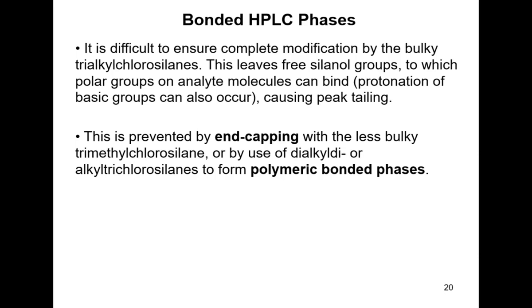And you may get some OH groups stuck in between them, and the reagents can't get in to react with those because they're getting blocked by the adjacent modifications. So you can end up with these OH groups still present, kind of buried underneath the bonded phase modification.